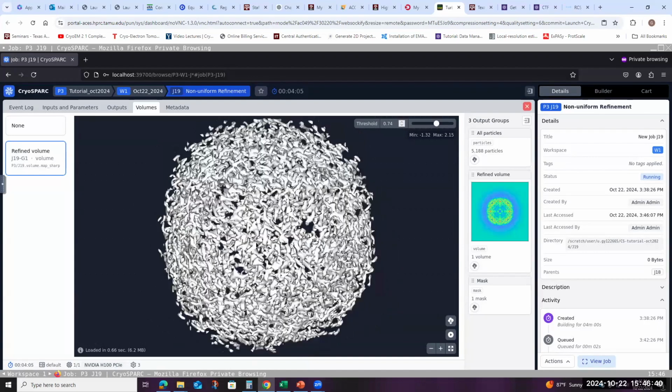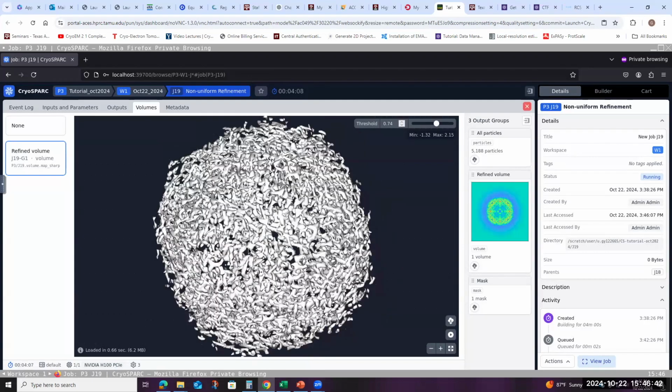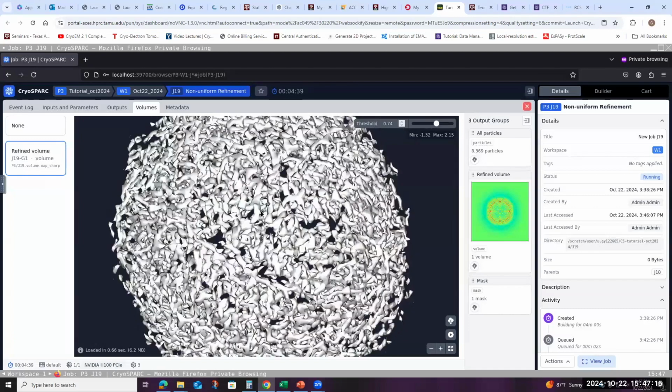That's the reason membrane proteins need a lot more data as compared to soluble proteins. Also for a small protein, you need to increase the signal to noise ratio, so you need a lot more data as compared to a large protein. And the same thing: if you have higher symmetry, you need less data. If you have lower symmetry, you always need more and more data.